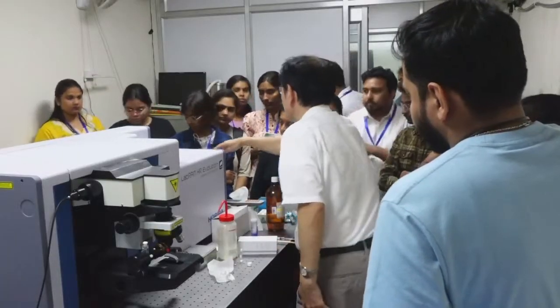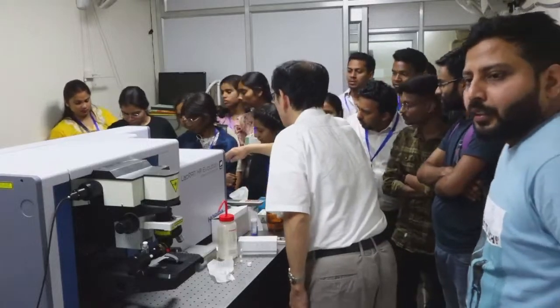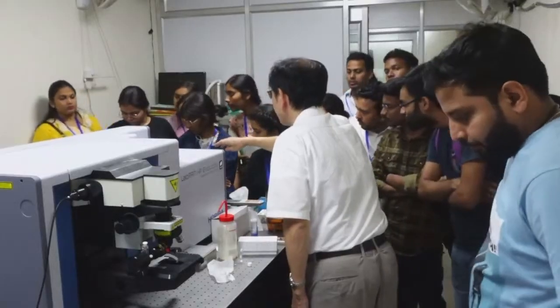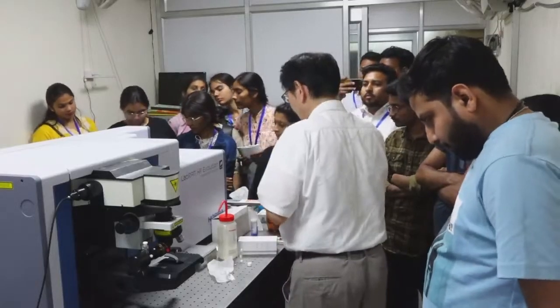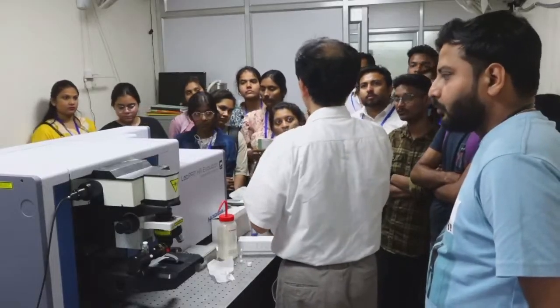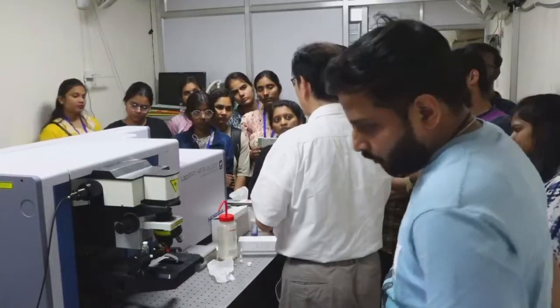Over there is the excitation laser beam. From left, 532 green laser, middle is 633 red laser, and right is 785 red laser. When the laser light comes into our naked eye, it damages the eye, and it's very hazardous.